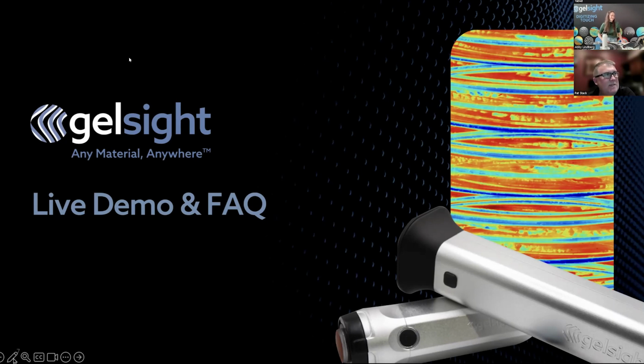There's one last question. It's regarding a GelSight Mini. Do you want to take this one? You can read it. We might have to follow up. Can we use the GelSight Mini with the software you just showed, which is, I believe, no, right? Is that correct? No. And will the Mini be able to export point clouds or STL soon?